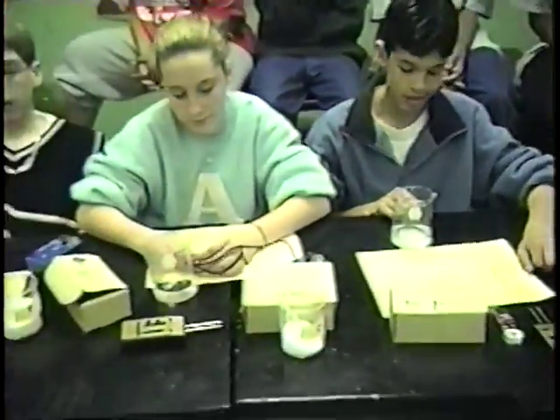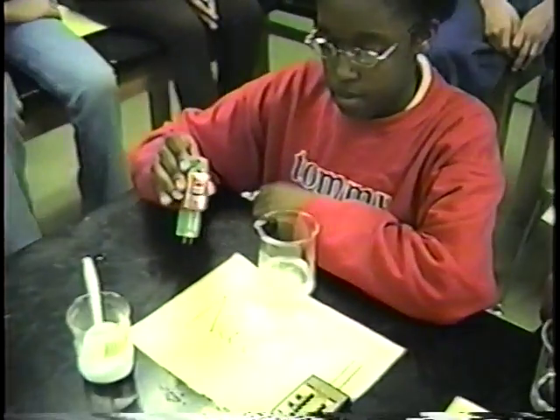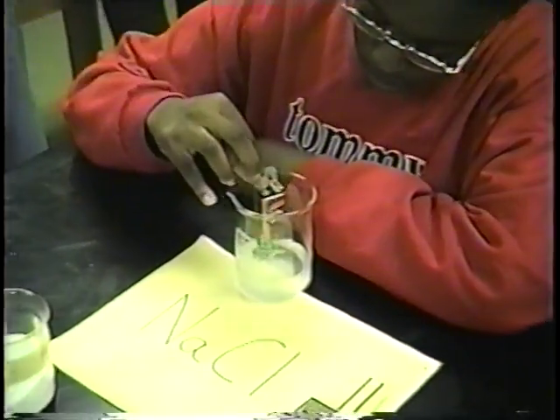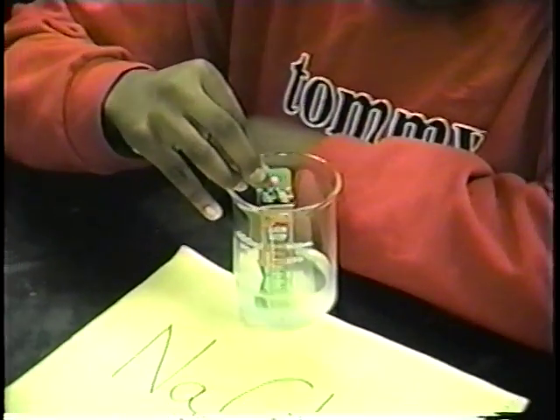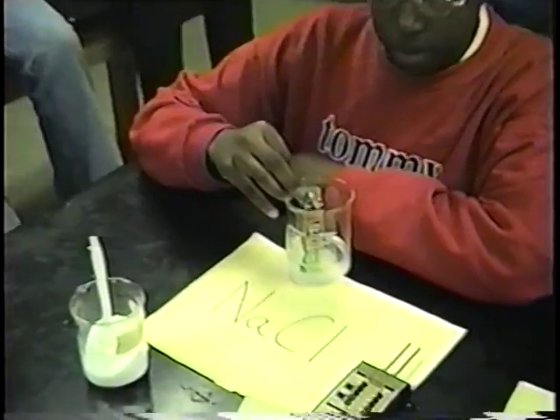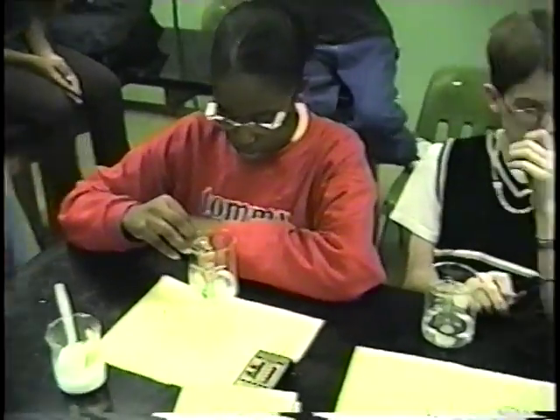Now we're going to test it with the other piece of equipment, and don't do it until I tell you, okay? You've got the one that has the blinking light, so put yours in and let's see if it blinks. Is it blinking? Yep. Okay, so if you had a choice right now, Opal, of whether this electrolyte is either strong, weak, or non, what would your answer be? Strong, because the strong electrolyte makes the light blink.